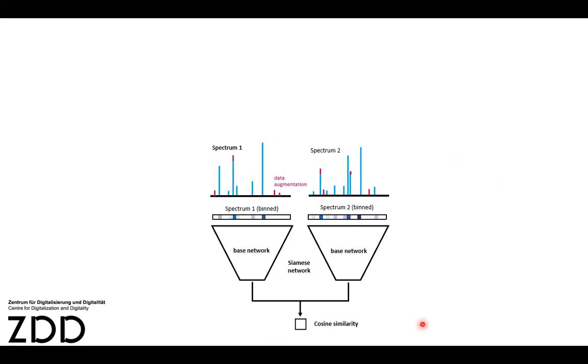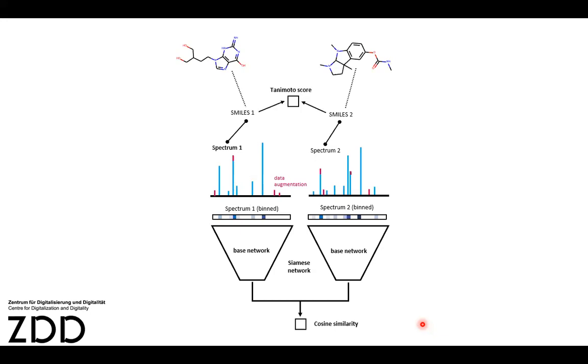This is of course not useful, because how can it learn anything from this? It can only learn if we tell it what it should ideally get out of this. So we do this in the following way. We train it with spectra where we have annotations. In the scheme that we saw yesterday, it's mostly level 2 annotations. What we get when we download GNPS data, there are faulty annotations for sure. It's not a clear reference number like this, but we assume that these are the true labels for now. So we know that for these spectra, we have SMILES and InChIs. And since we have SMILES or InChIs, we can also compute the true score, what we call the true score here in our conception.